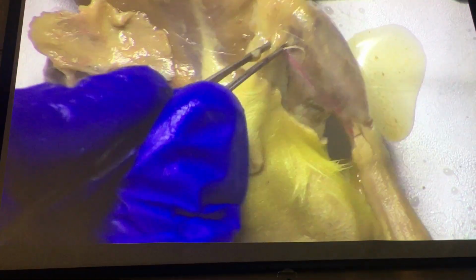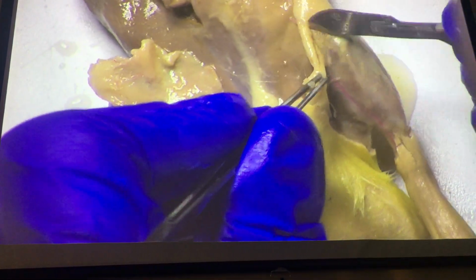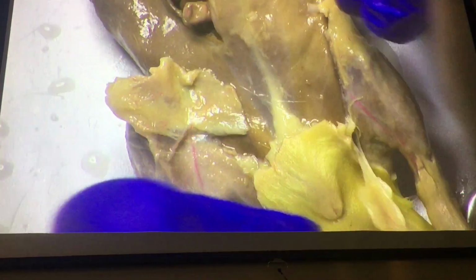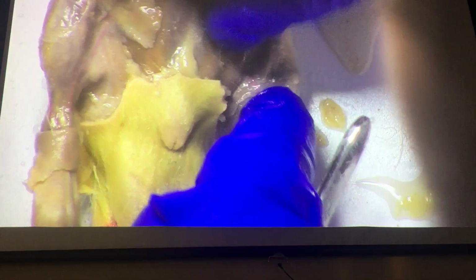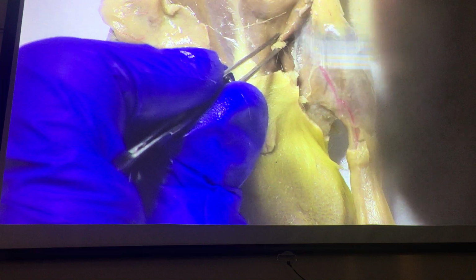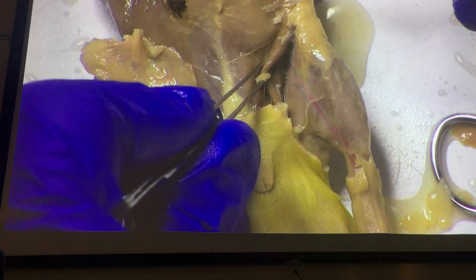All right, so the initial work is fairly easy because you got a big clump of fat here. Now sometimes there'll be a blood vessel associated with that fat. That can be removed. Then you're going to want to come in here and work where the abdominal wall meets the thigh. You've got to be careful when you do that, obviously. If you make a mistake, you're going to cut into the abdominal wall.